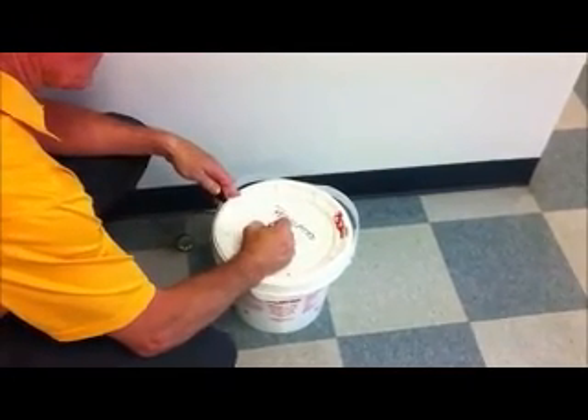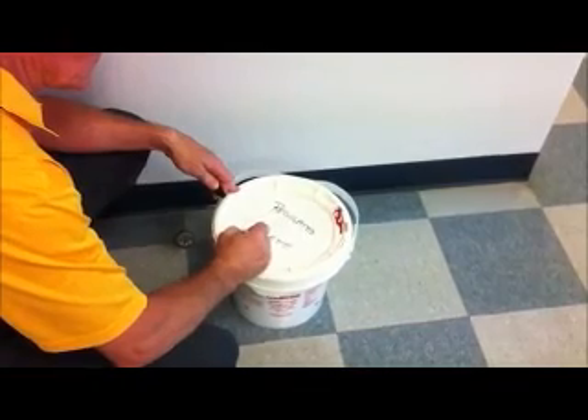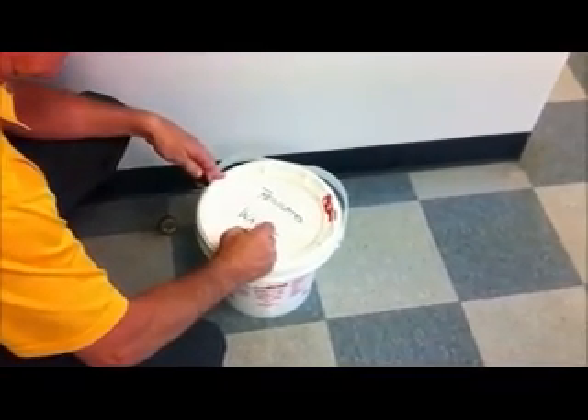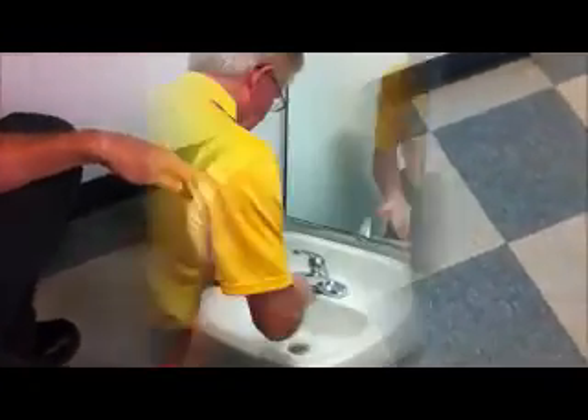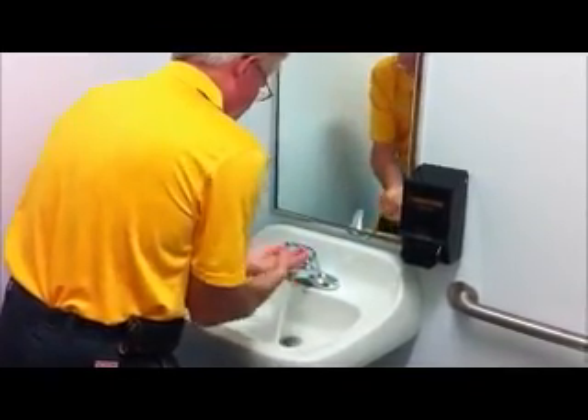Step 10. Follow the proper procedures for disposal. Properly wash your hands under an approved hand wash sink.